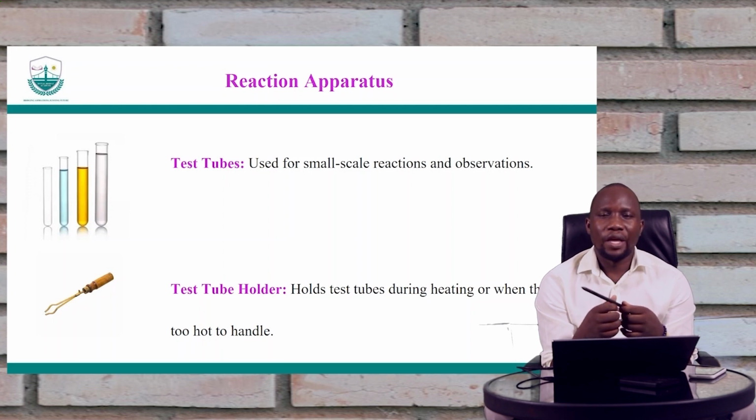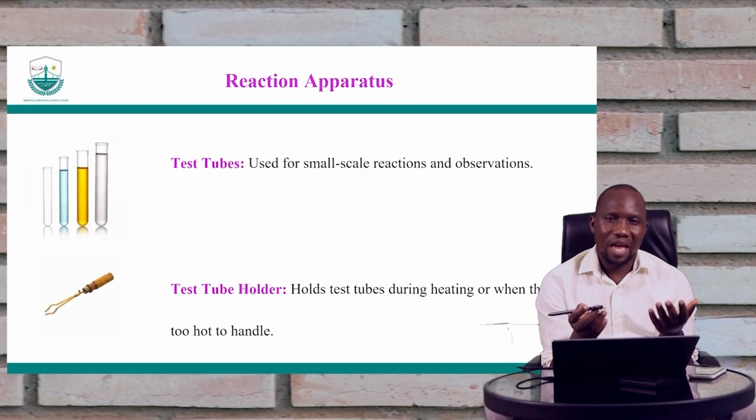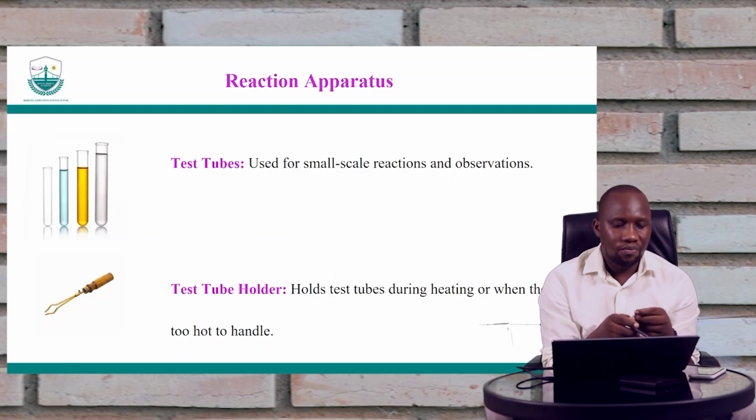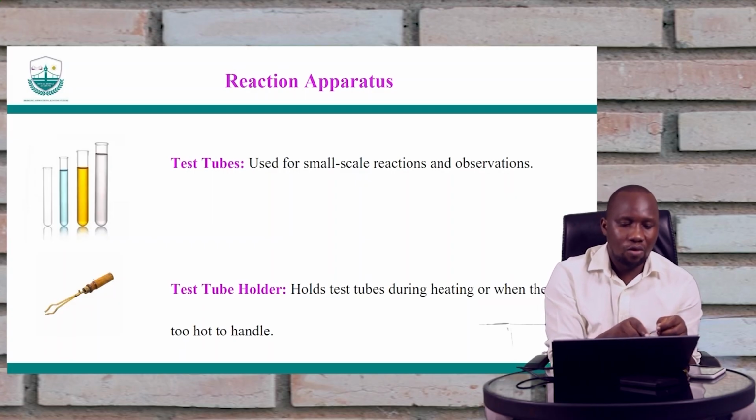If you heat a particular solid, how does it behave? How does it react and how will it appear? Use a test tube. And then, since you're going to heat it, you will not be holding it directly. Therefore, you need to have a holder.